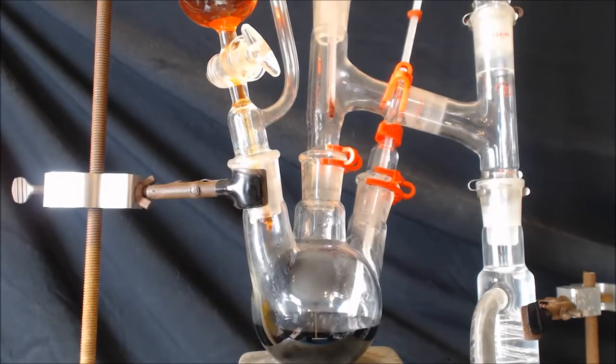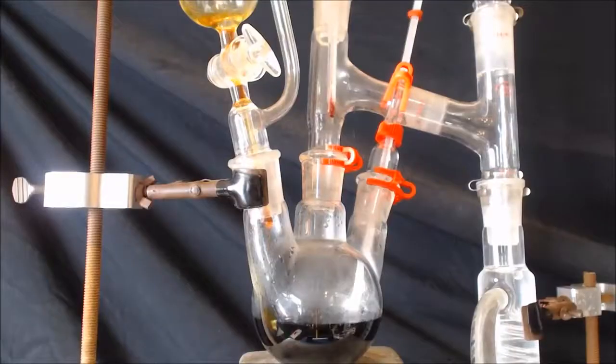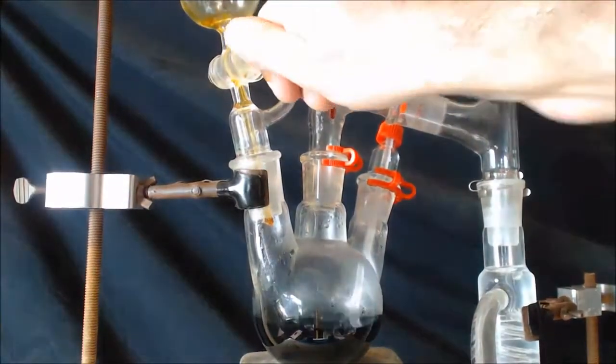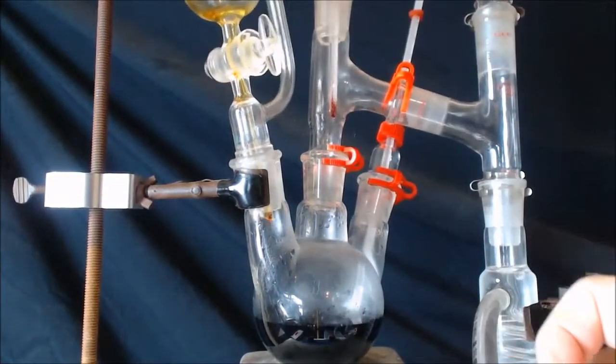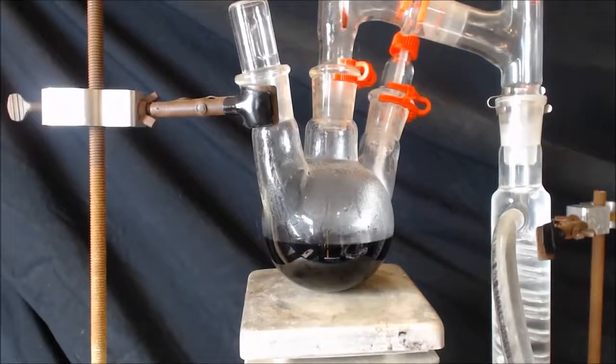I don't know if it's because I'm making so little or what the deal is, but nothing is coming off. Nothing. You can see I got it really coming out now. I could smell it now. Taking off that equalizing funnel. It's starting to come up too now.